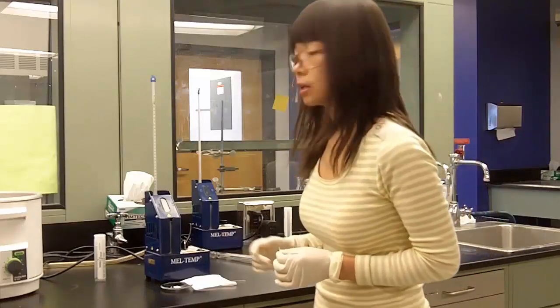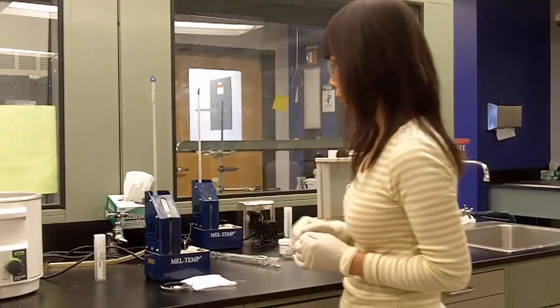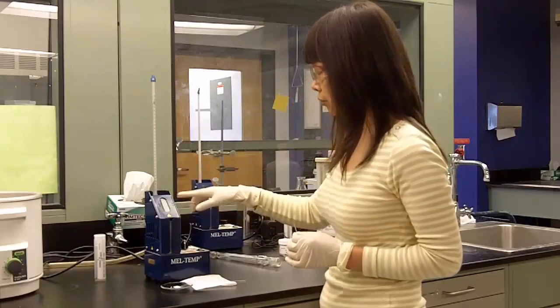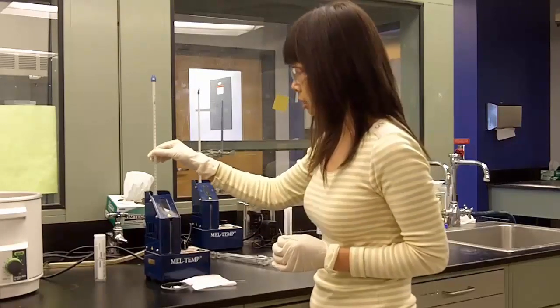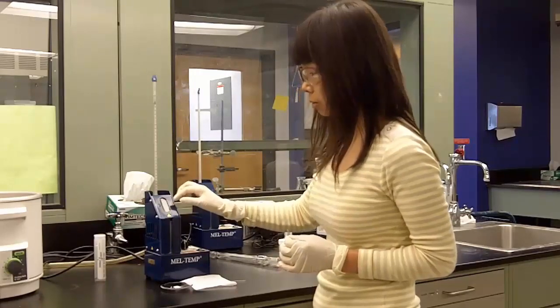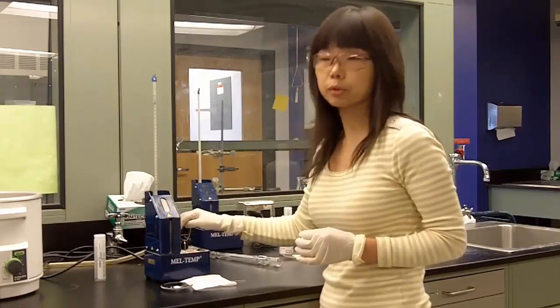Melting points are frequently used in organic chemistry to determine your compound identity and purity. The apparatus to determine a melting point is called a melt temp. It has the following major components: a thermometer to read the temperature, a magnifying glass so you can observe the status change, and a dial to control the temperature.